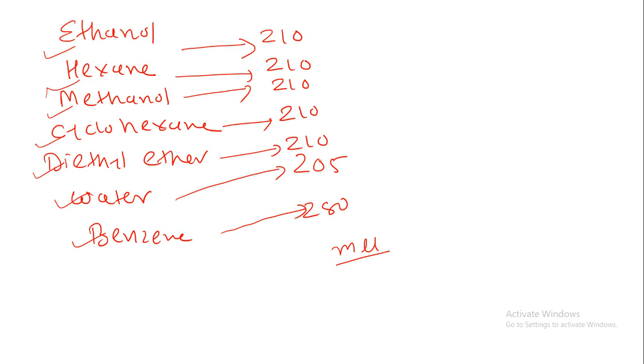Hexane and other hydrocarbons can be used as they are less polar and have the least interaction with the molecule under investigation. For ultraviolet spectroscopy, ethanol, water and cyclohexane serve the most important purpose. So these are the solvents that can be utilized for UV spectroscopy.